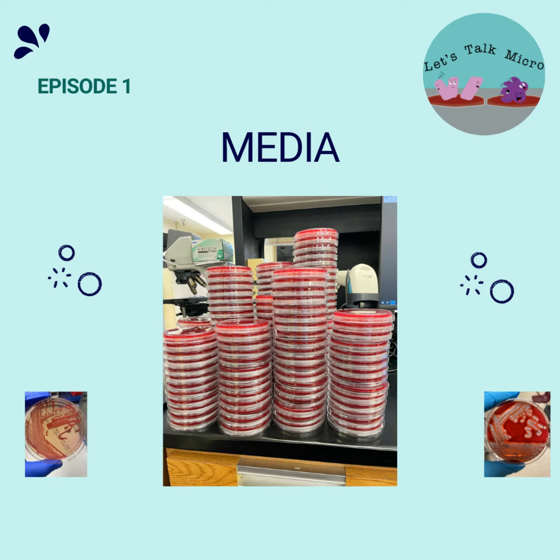So the nutrients are in this agar that they need to grow, but what else do they need? Do they need anything else? Yes, right? They need oxygen and carbon dioxide. As you know, most organisms are either aerobic, anaerobic, or facultative anaerobes. And actually, most of your classic pathogens are facultative anaerobes, which means that they grow aerobically, but they can also grow anaerobically. So that's why you have these incubators that have carbon dioxide to give to the organisms so they can grow. And they also need the right temperature, right?